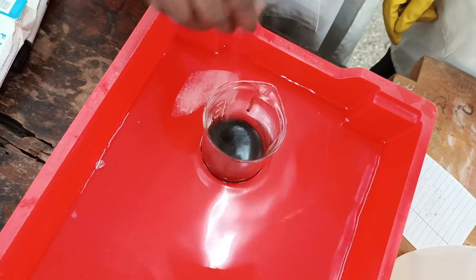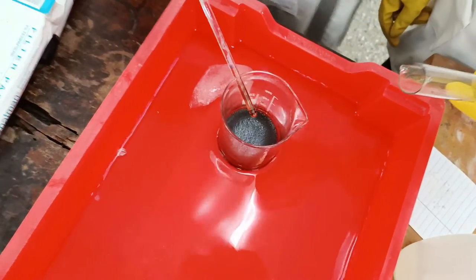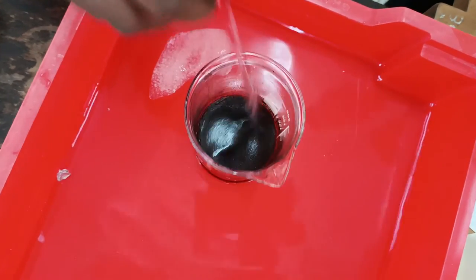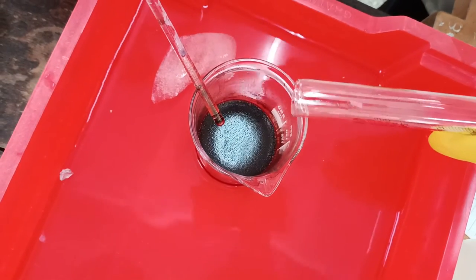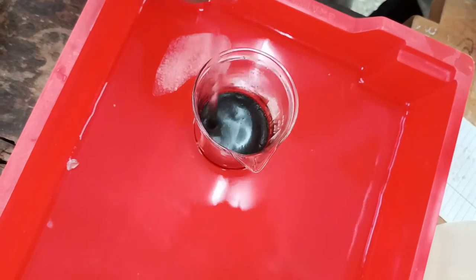So this is just redox taking place. Exactly. You see that the red color is showing. Yes, that is the complex, the hexaammine cobalt 3 chloride.